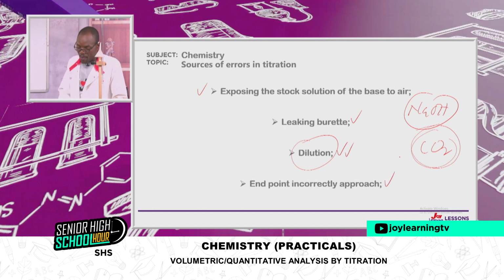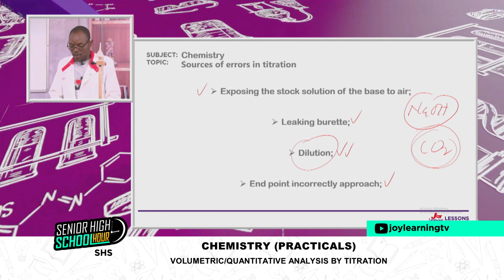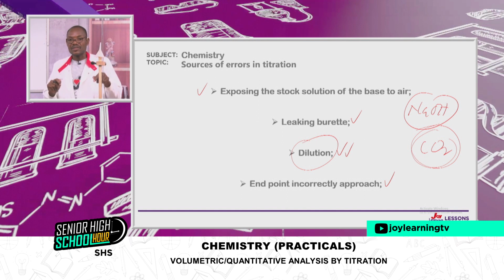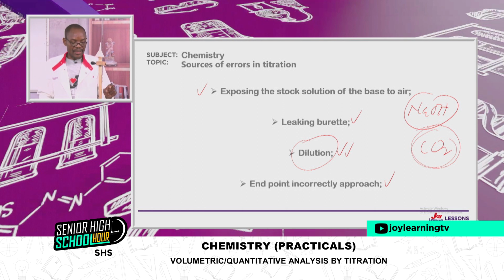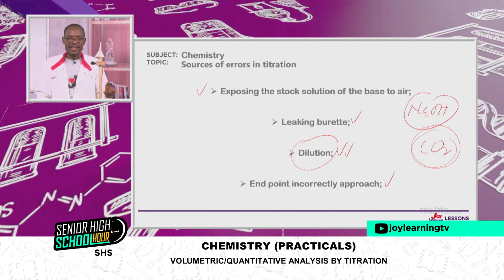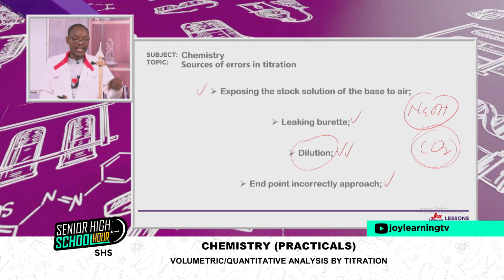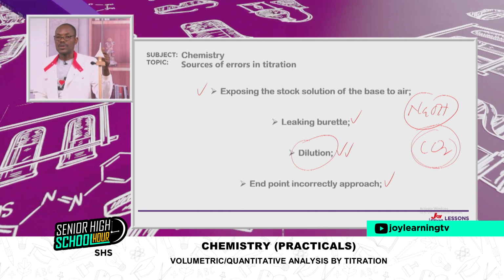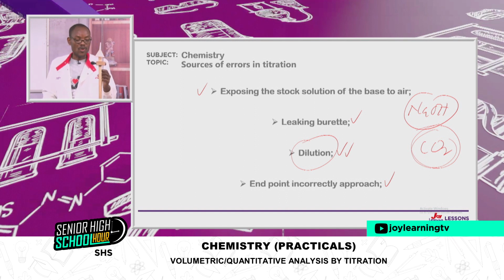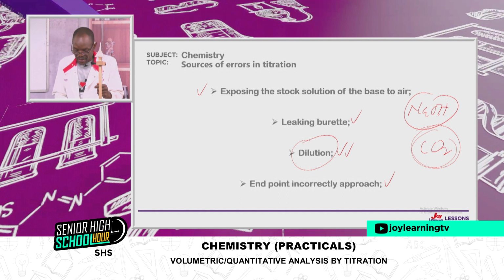This is very, very important. The endpoint incorrectly approached. What did we say? We said that the endpoint is marked by the indicator just changing color. It means that just changing color, it can lead to some other color. So the just one is the first one, and that is the accurate. After that, you have overshot the endpoint, or you have passed the endpoint. Therefore, the values you are going to read will not be accurate. So take note of these things.